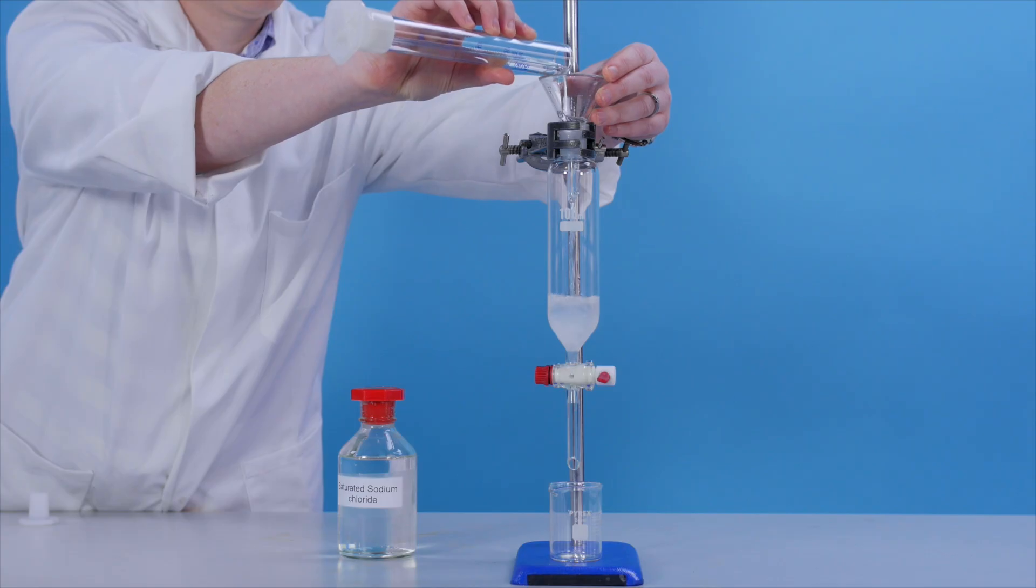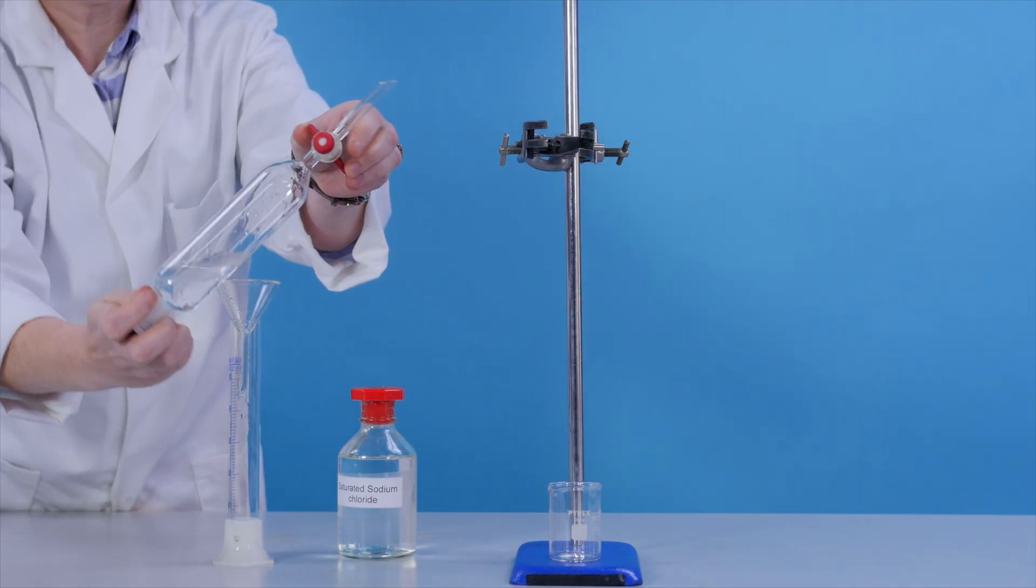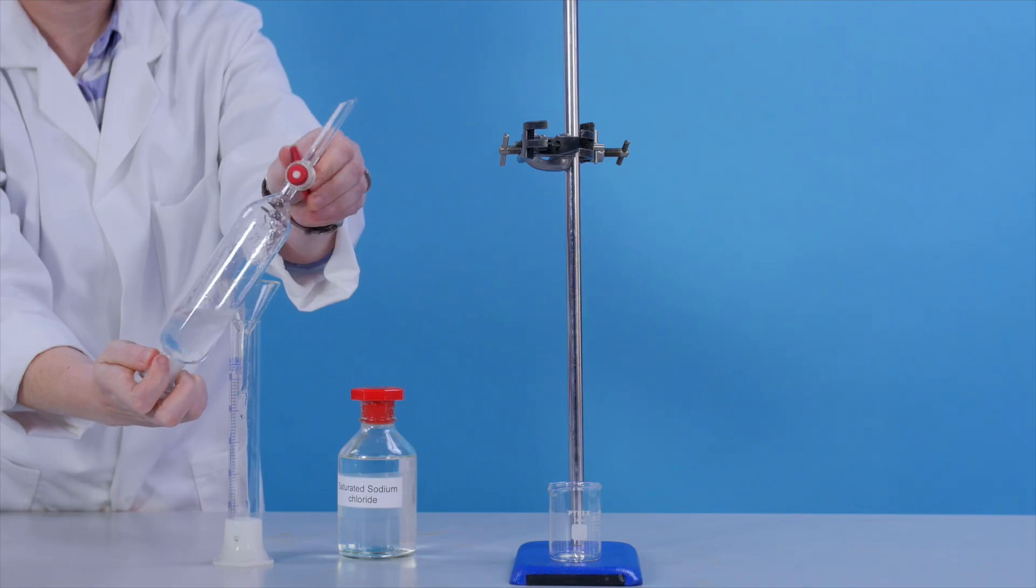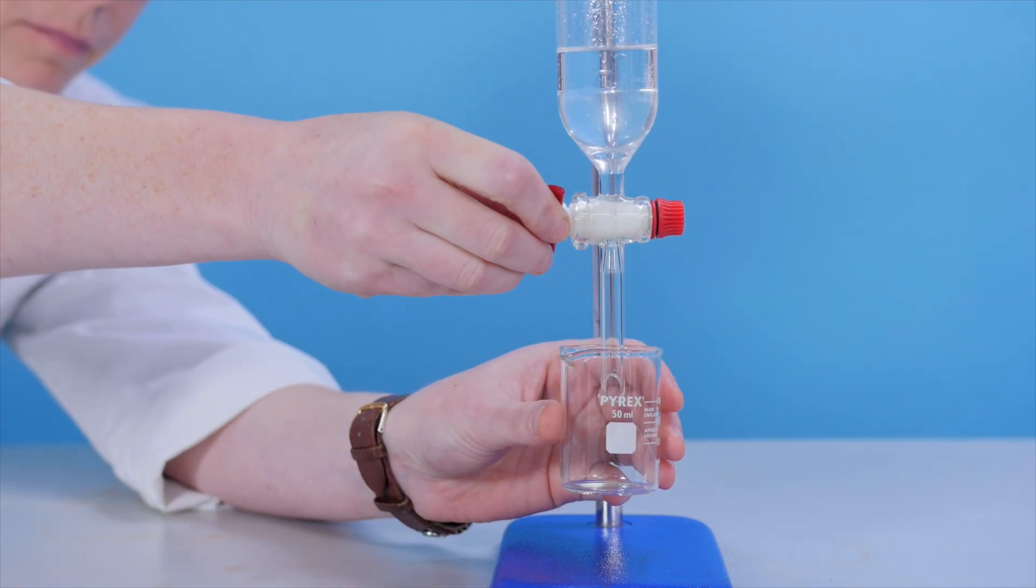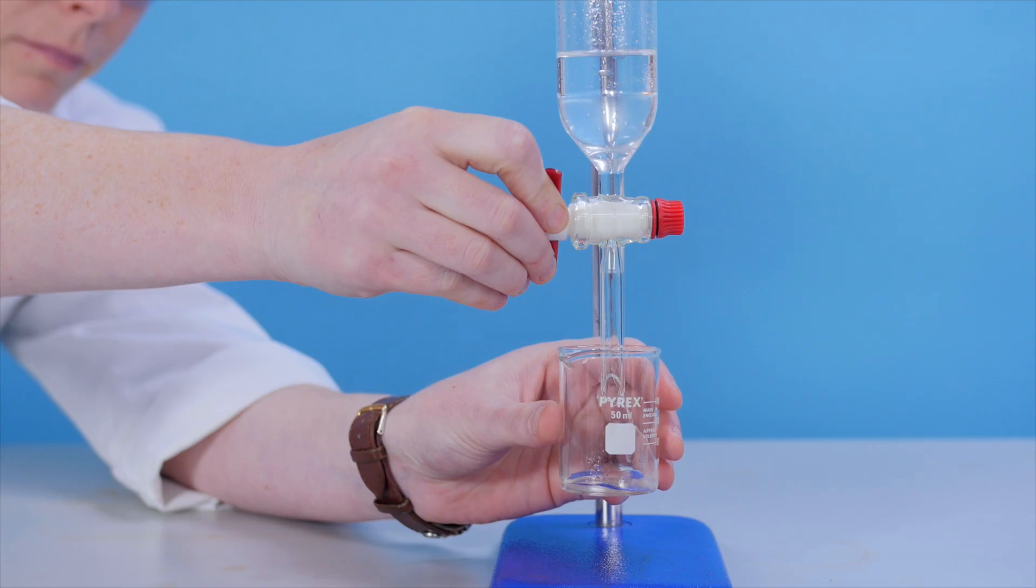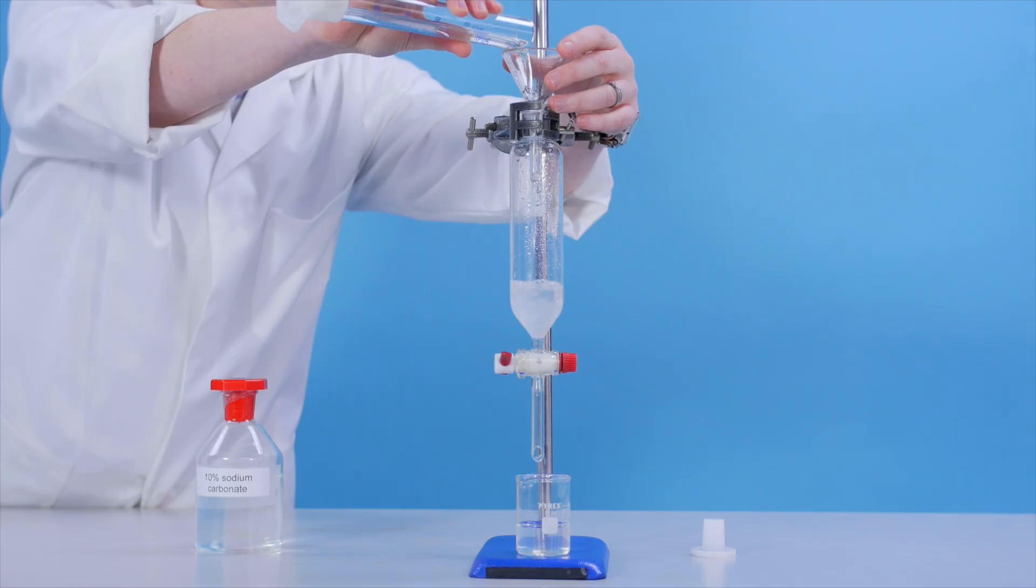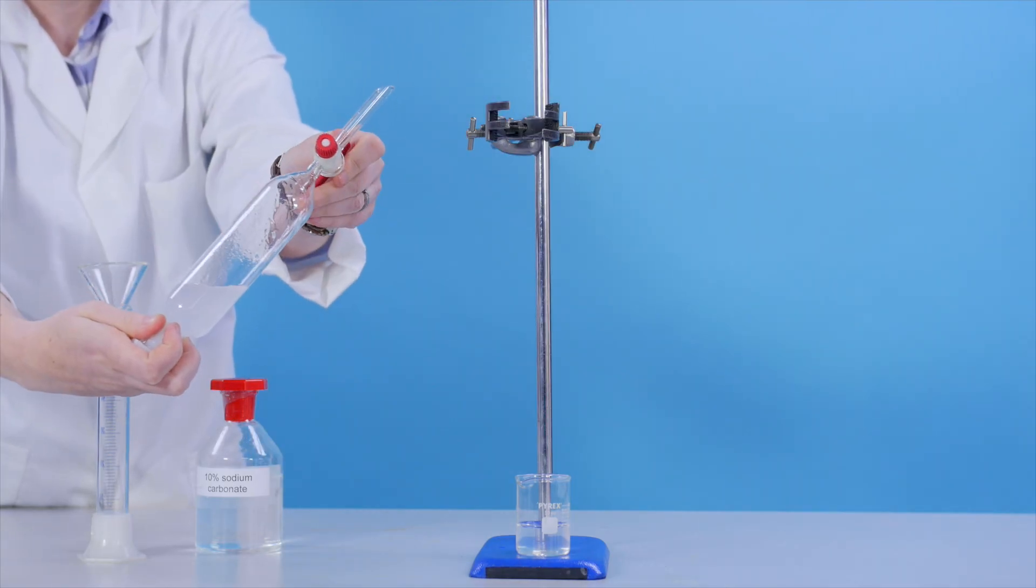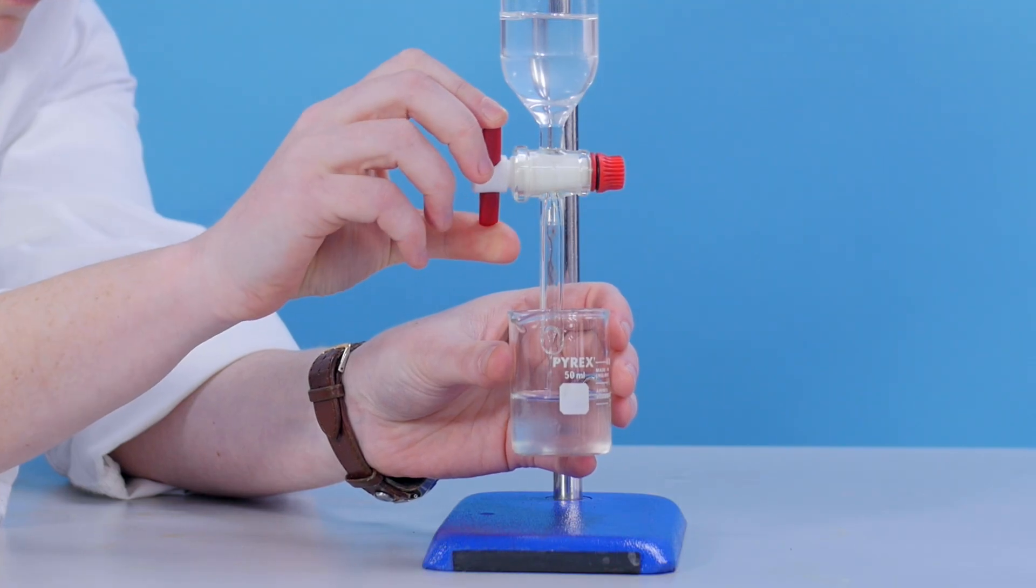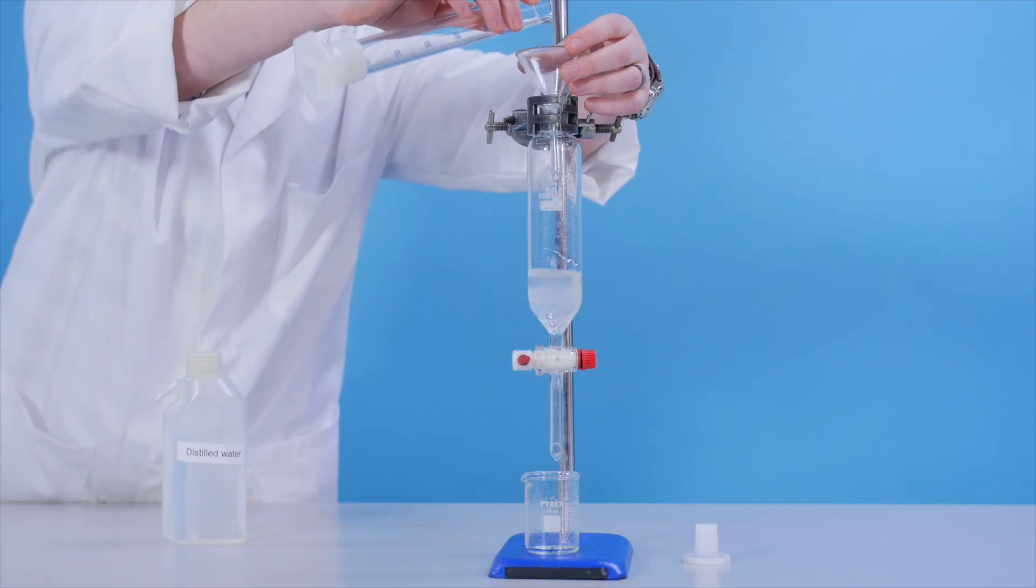Remove impurities by washing the organic layer. First, with a saturated solution of sodium chloride. And then with an aqueous solution of sodium carbonate. Give the product a final wash by shaking with water.